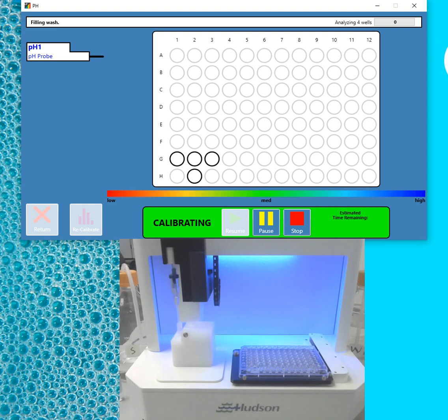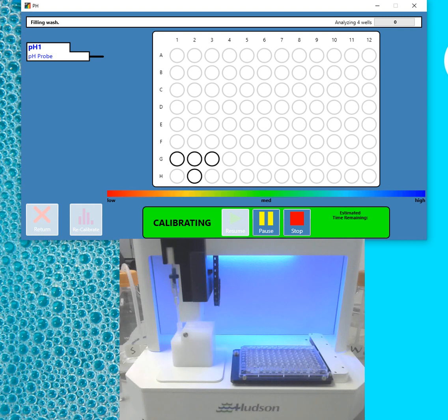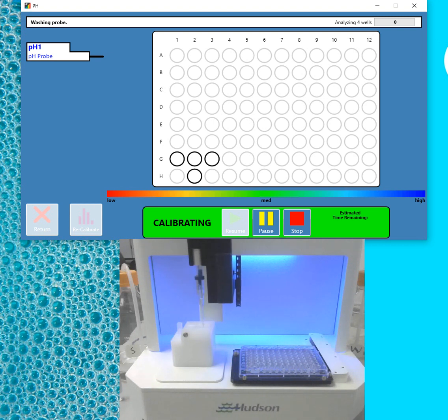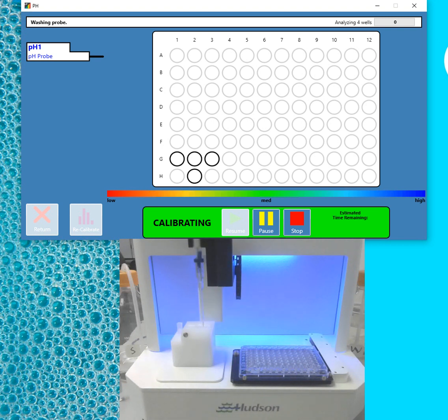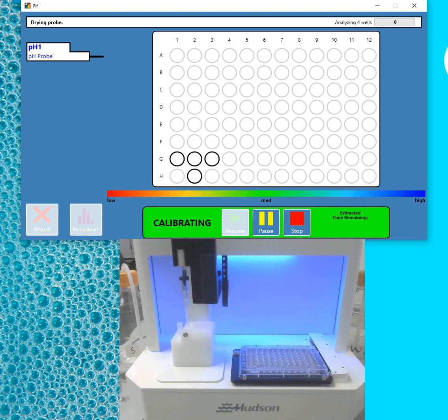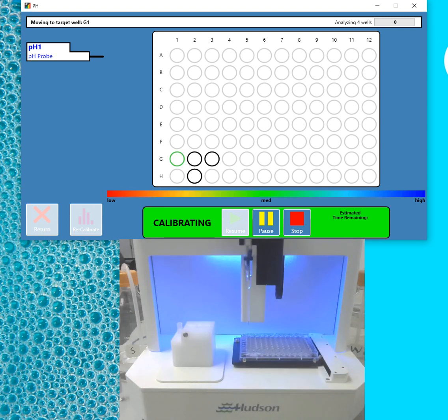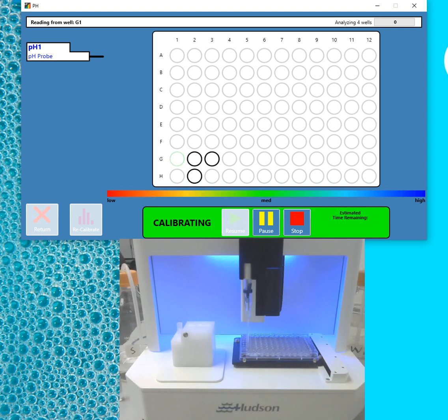And I'll let the instrument catch up before I continue on. So now you can see it running through the deionized water. It's doing a rinse. It's going into the blow-drying station to be blow-dried before it takes the first sample. The well was just emptied and is now being refilled with deionized water.